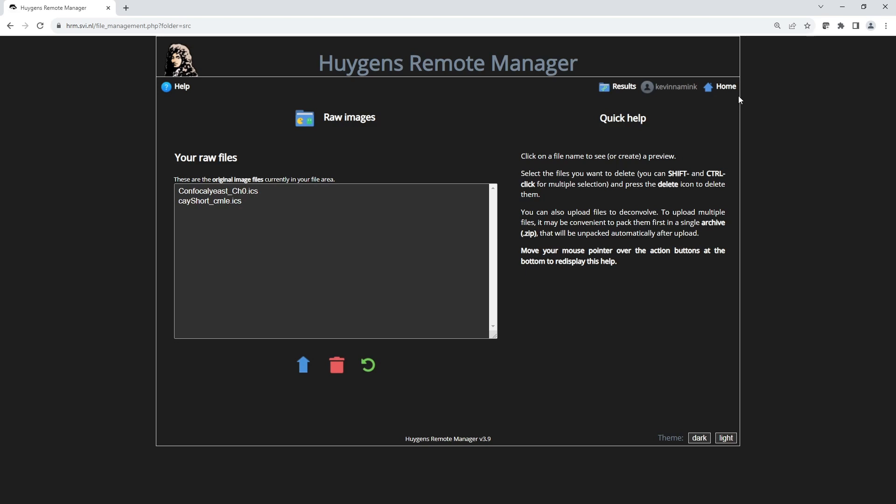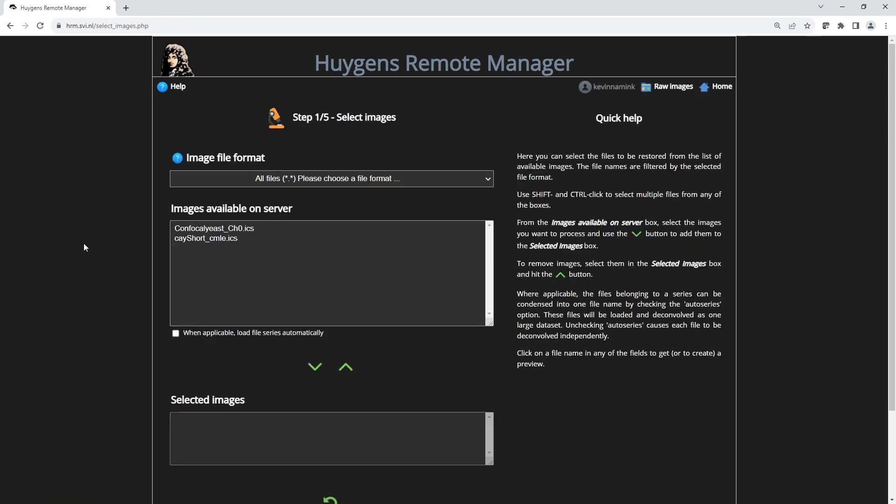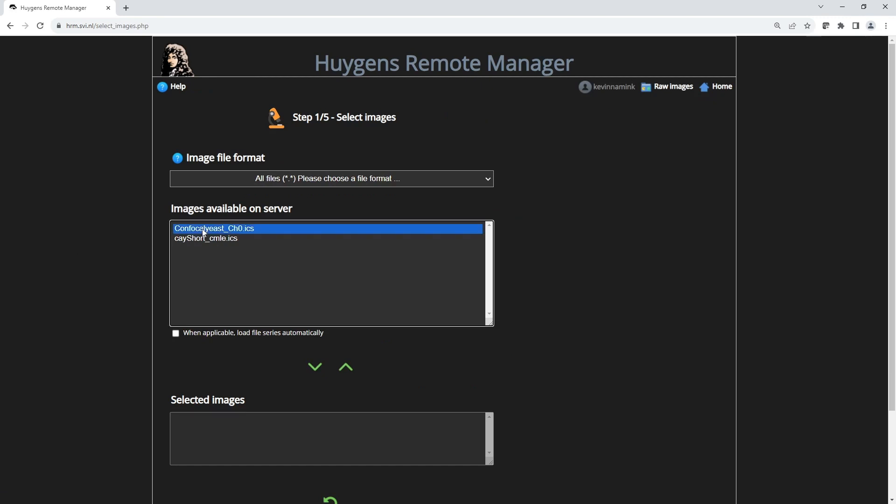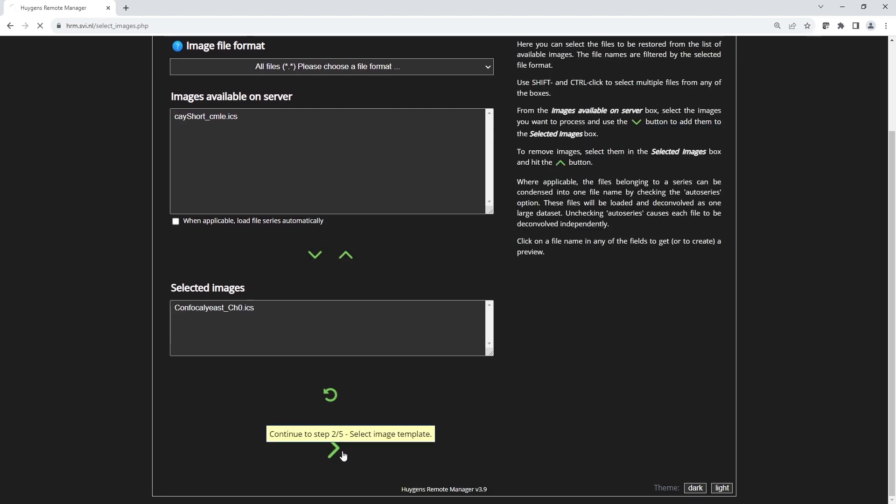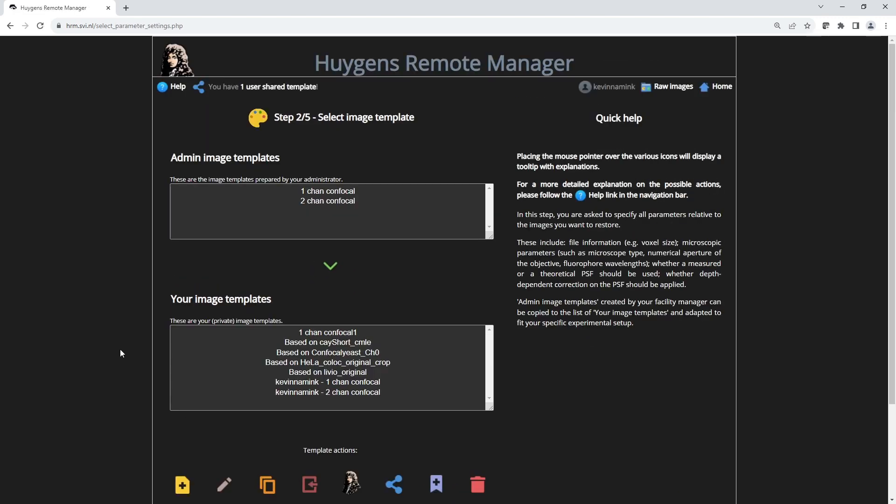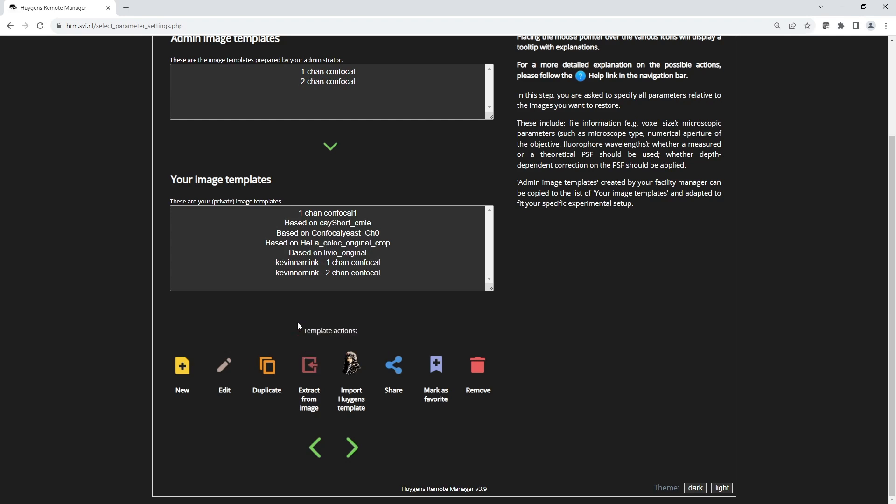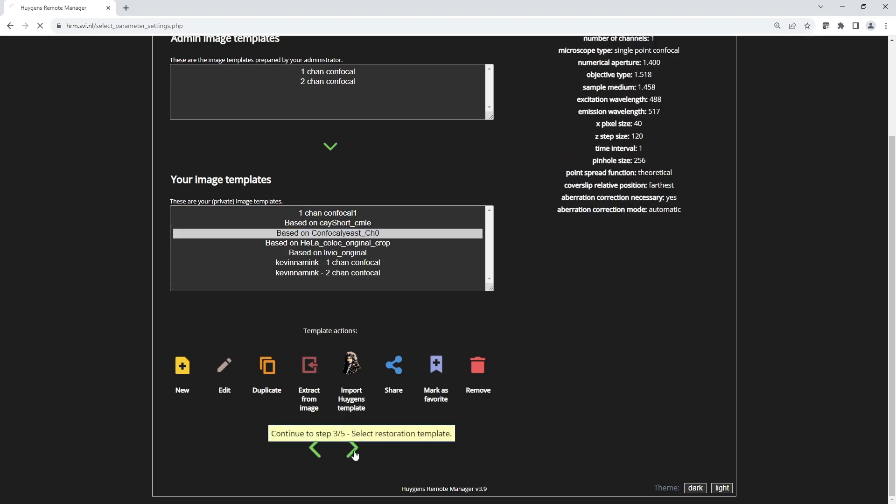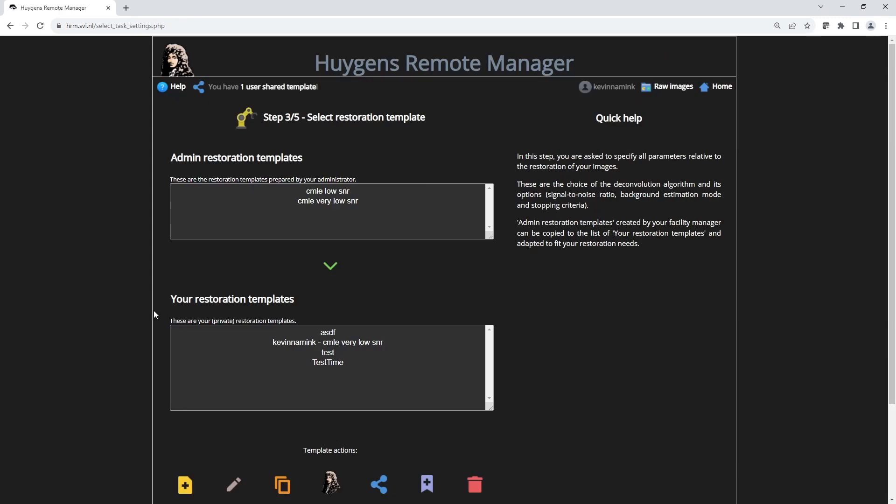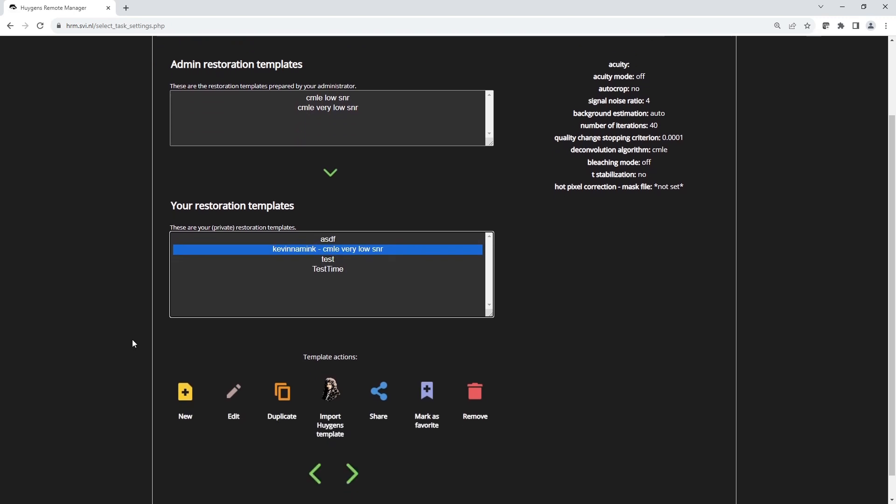To create a job, we go to the Launch Jobs option. Then we can select the image we want to process. In this case this image. Then we select the image template. This can be supplied by an administrator to make this less complex for the user. But in this case I have used the Extract from Image template action to extract the image metadata from the image I uploaded. That is this template. Then next we select the restoration template. This can also be supplied by the administrator. And in this case the administrator supplied CMLE very low SNR. It is reasonably suitable for deconvolving.